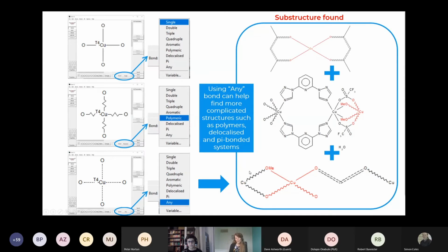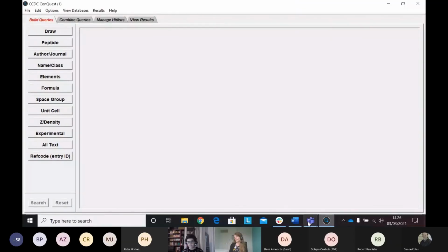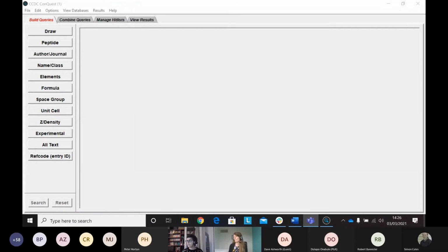So I'm now going to pass over to Ilaria, who's going to take you through in more detail a demo of Conquest in action that you can follow along to. And as we go through, if you have got any questions, please do type them in the chat box and we'll try and answer them as we go through.